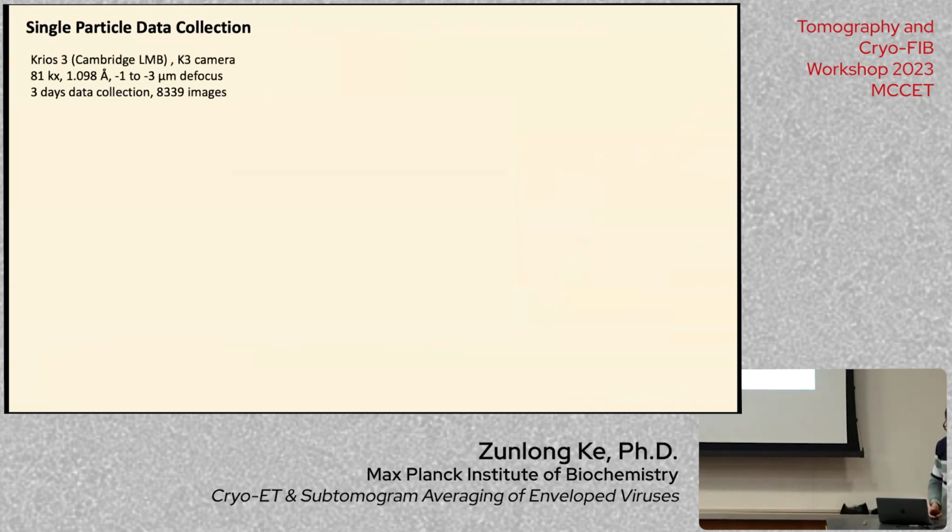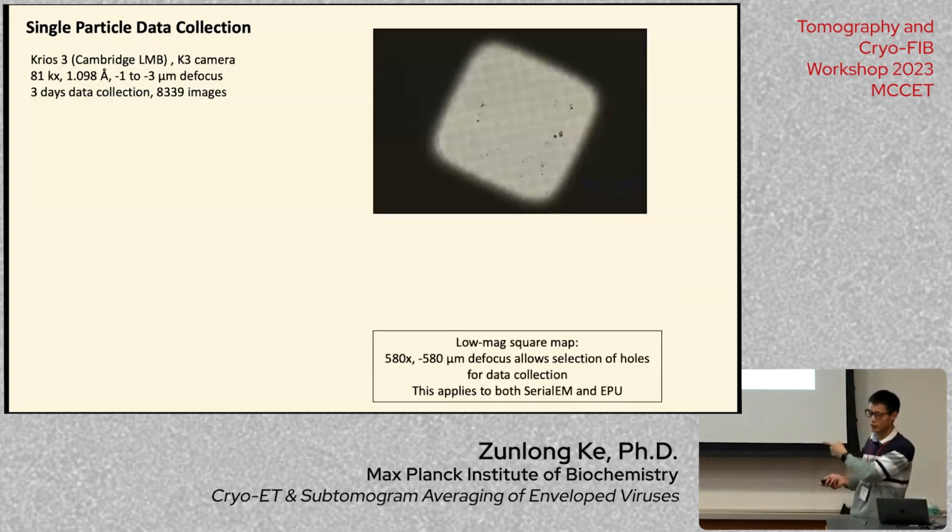For the last couple of minutes, I will talk about this part: a lot of Cryo-EM people have started to do tomography, right? I was thinking that in this particular sample, as Alberta said, we should make most use of the sample we got, using any method we can. So this is the project I did on the SARS-CoV-2 spike.